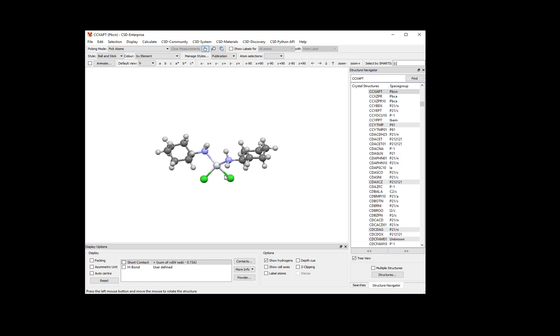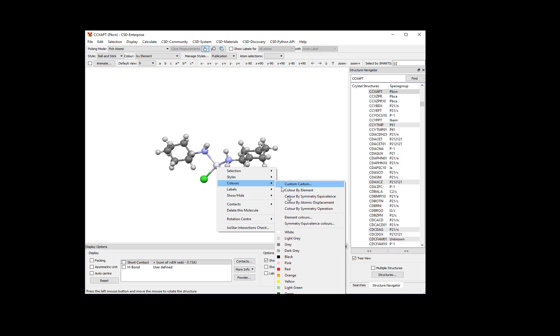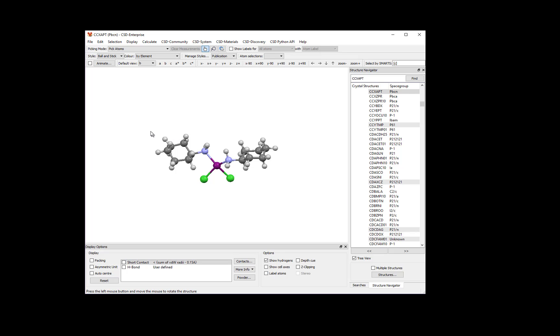You might find that the white Platinum atom doesn't stand out against the white background. To change its color, right-click on the Platinum atom and choose Colors, Purple. You can choose any color on the list that you prefer.